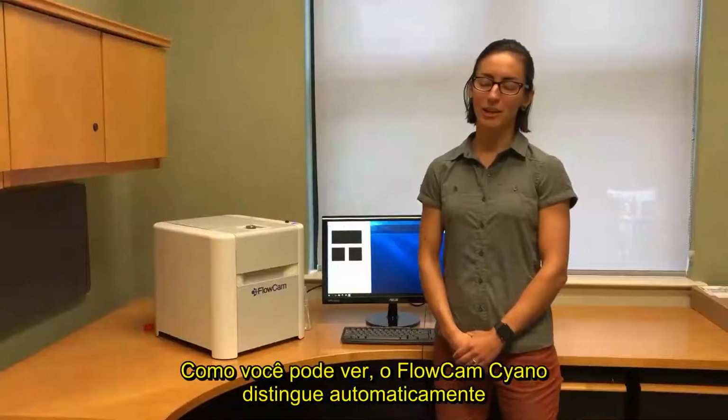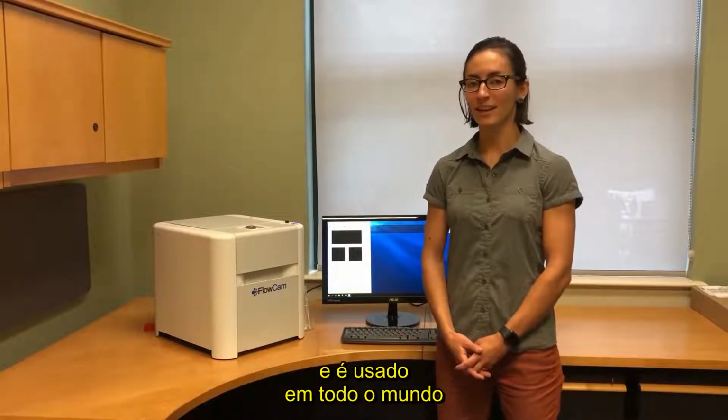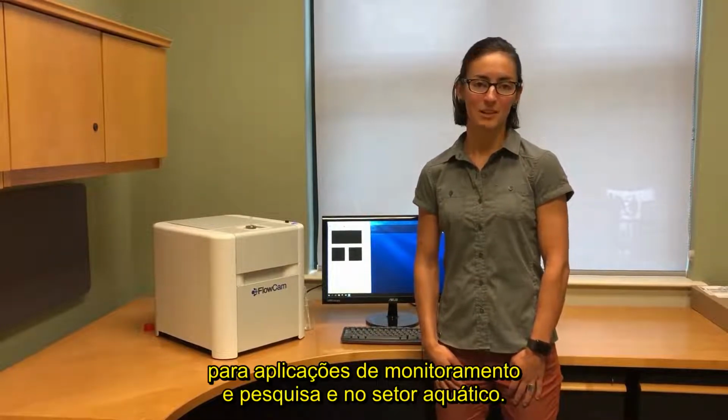As you can see, the FlowCam Cyano automatically distinguishes cyanobacteria from other algae and diatoms and is used all over the world for both monitoring and research applications in the aquatic sector.